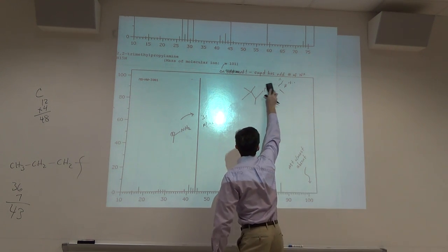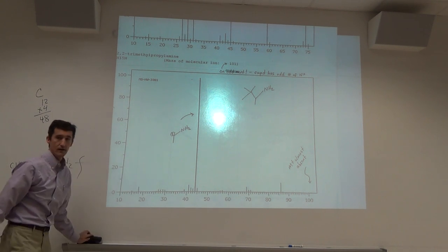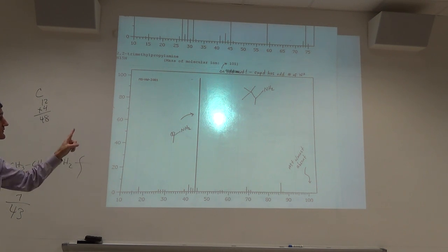First thing we can say about this is the molecular weight is odd. All previous examples of the molecular weight were even, unless you consider an isotope of carbon. But typically with carbon-12, it's always going to be even in the previous ones. Why is this one odd?